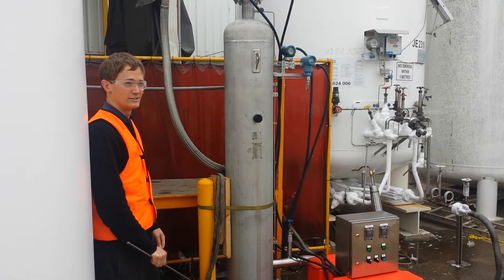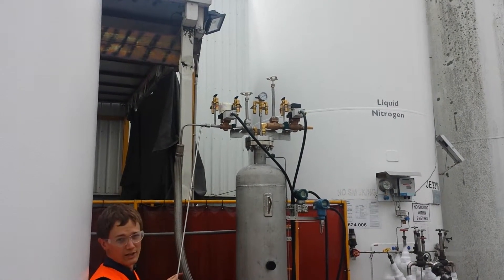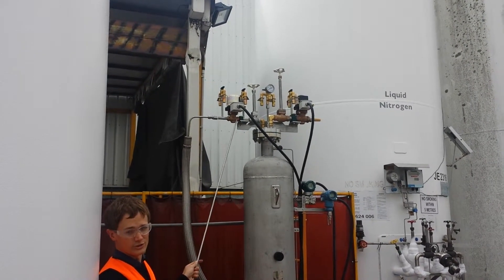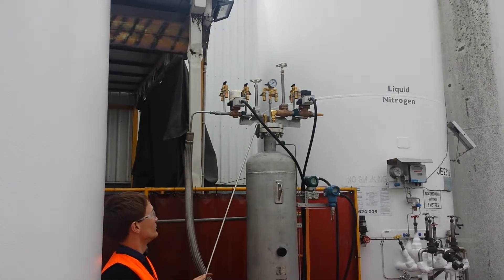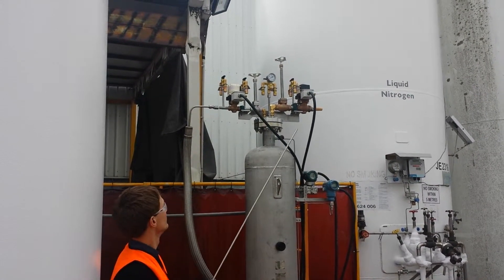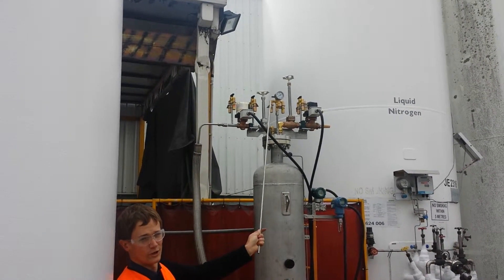which is vacuum insulated. We have our valves up the top. We have our liquid-in section with a Magnetrol solenoid here and a manual control over here. Then we have our gas vent, again with a manual valve and a solenoid valve. This is a special order CryoBuddy and we have a switchover manifold on the relief valves.